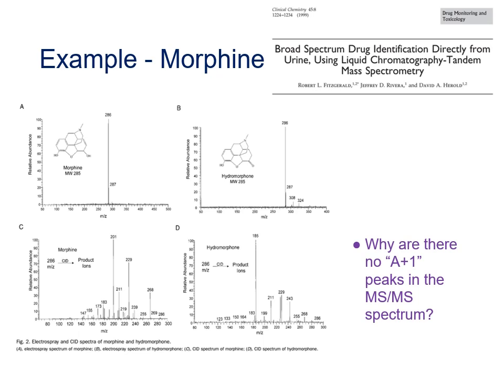One other thing you might have noticed in this data is that in the tandem mass spectra there are no carbon-13 peaks, but in the original mass spectra there are. The reason for this is that when the parent ions were isolated, only the monoisotopic peaks were selected. Therefore, there are no heavier isotopes at all in any of the fragments. So it's worth remembering that when you're selecting ions for isolation, if you don't isolate the entire isotopic distribution, then the isotopic distribution in the fragments will be affected by this.